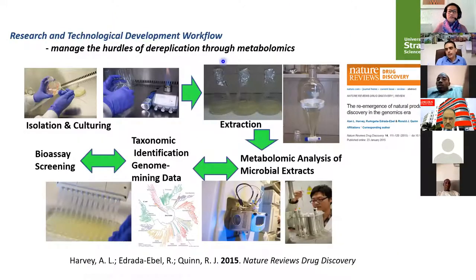So research and technological development, we do follow this workflow. This could also be applied to plants, so not only with microorganisms. Of course, we start our isolation and culturing from our different resources, and then we go into extraction. And our extractions are subjected to metabolomic analysis. So here we start with chemistry, and basically we do both mass spectrometry and NMR. But in parallel to this, we work a lot with molecular biologists to do the genome mining data for us. And of course, again, most important is that we do want to work with bioactive components. So the role of the pharmacologist is also important when it comes to bioassay screening.